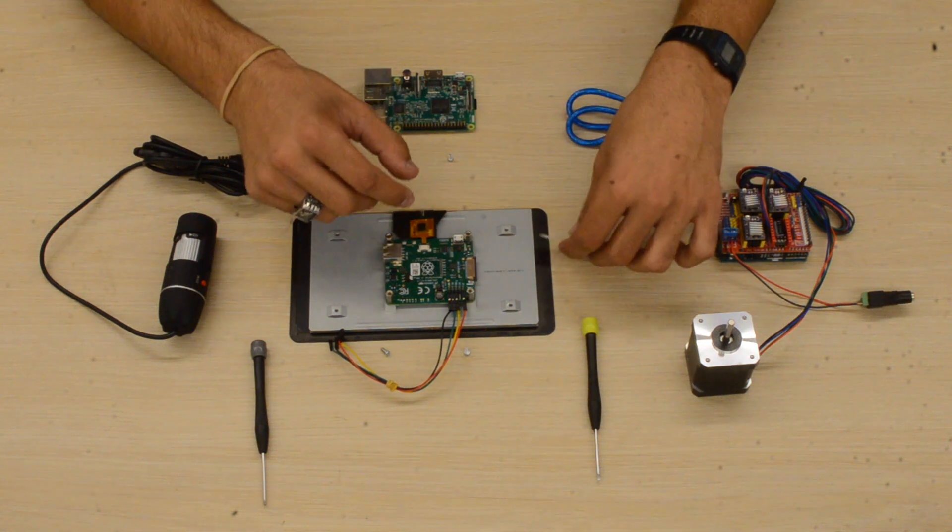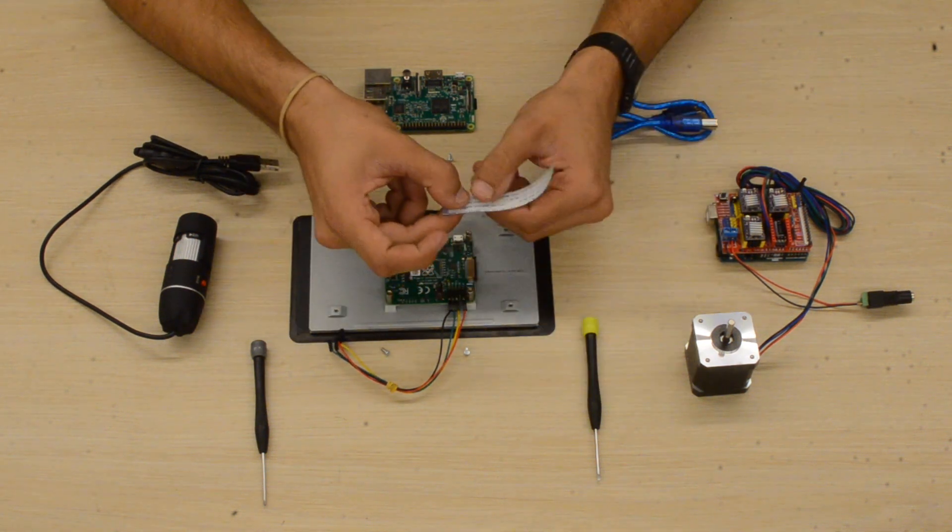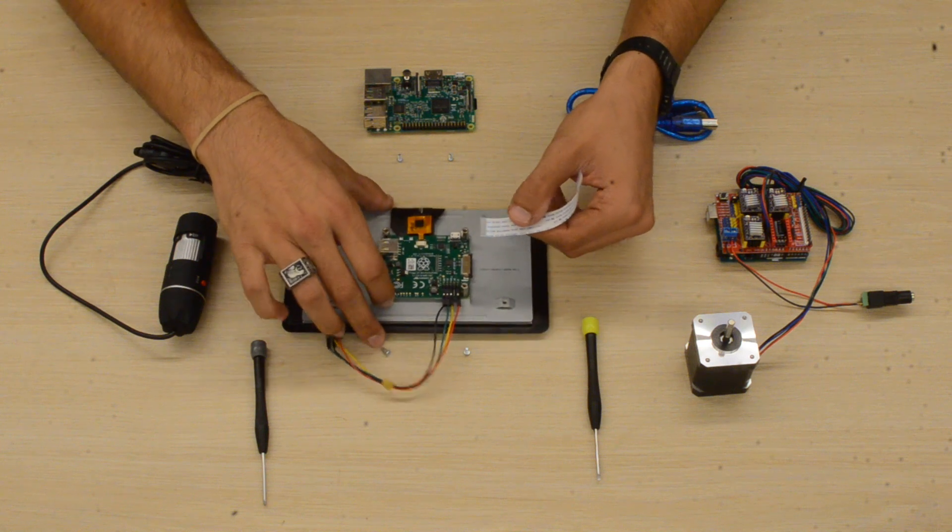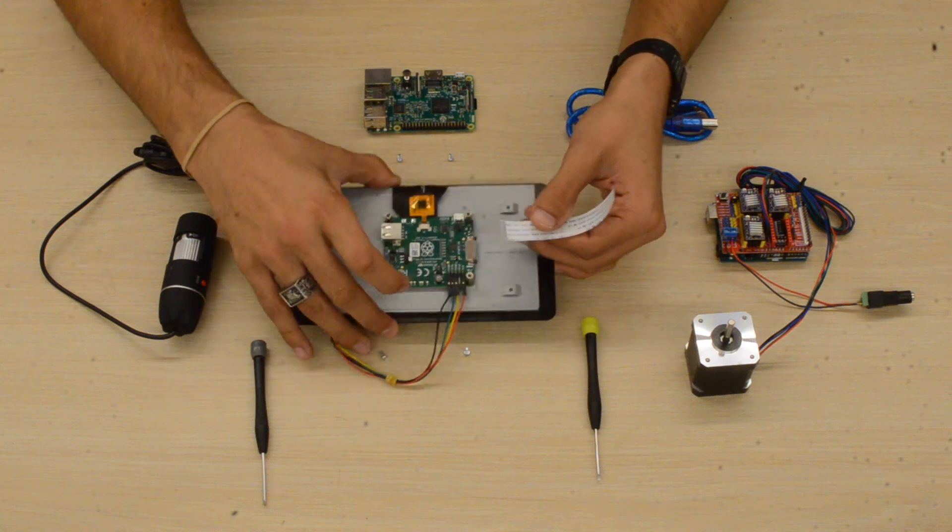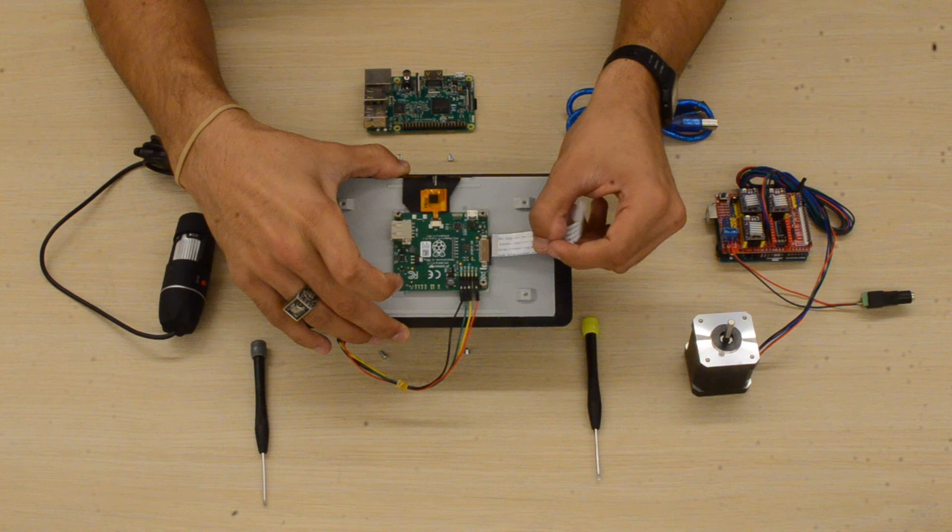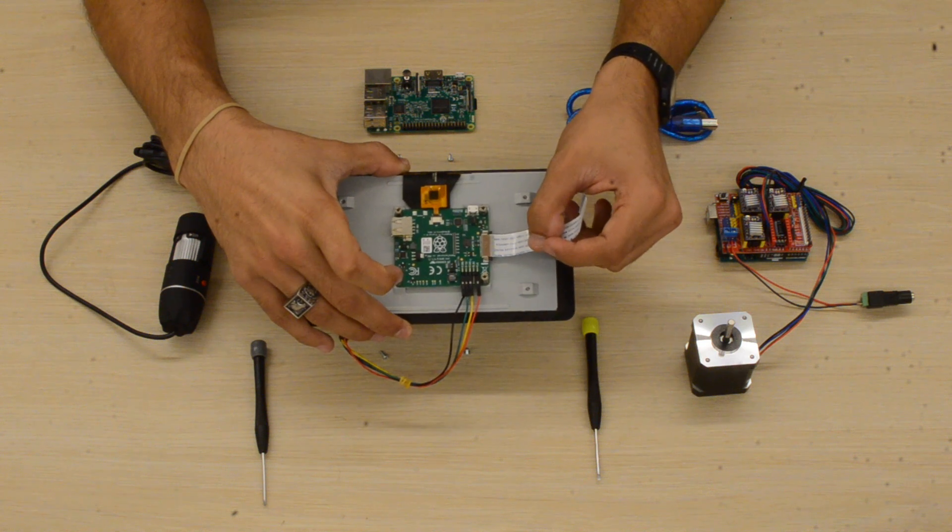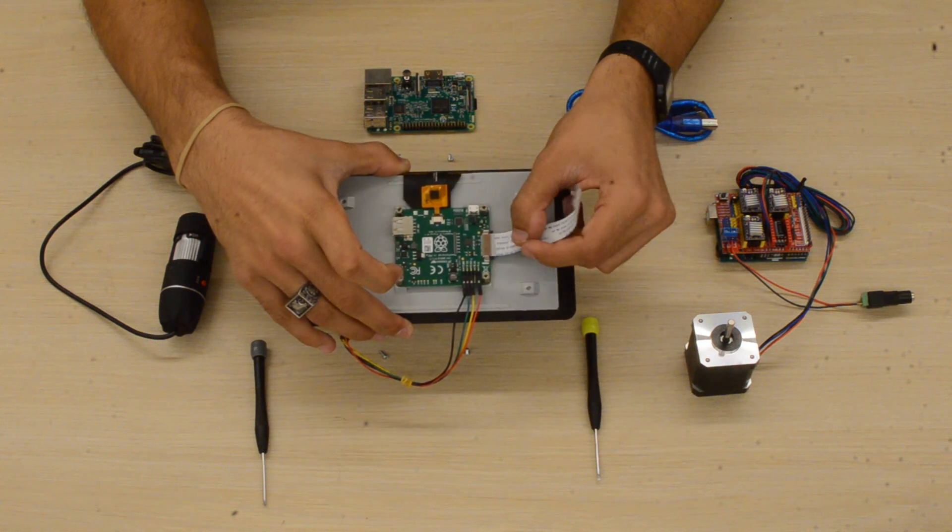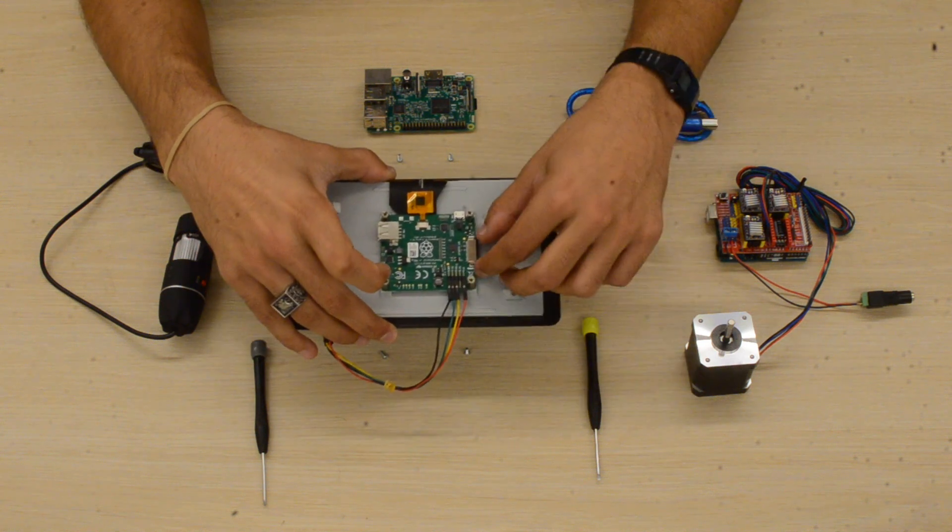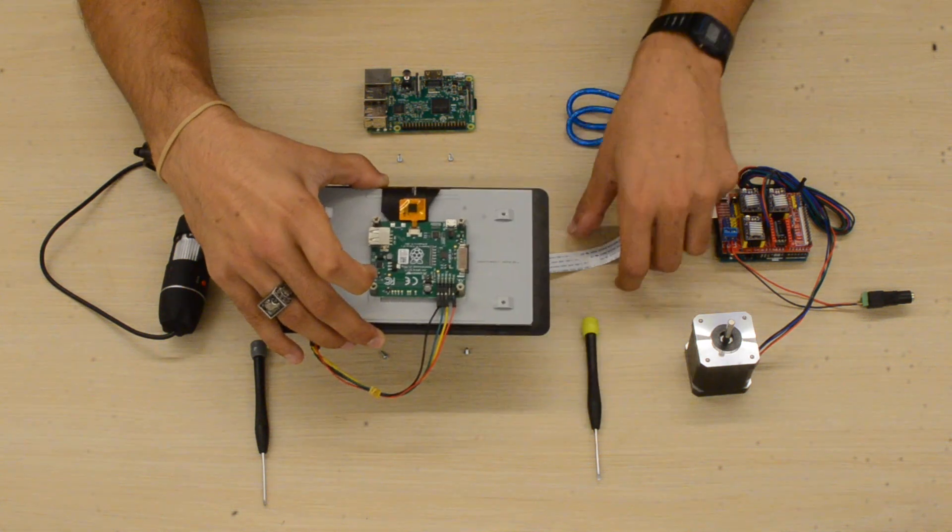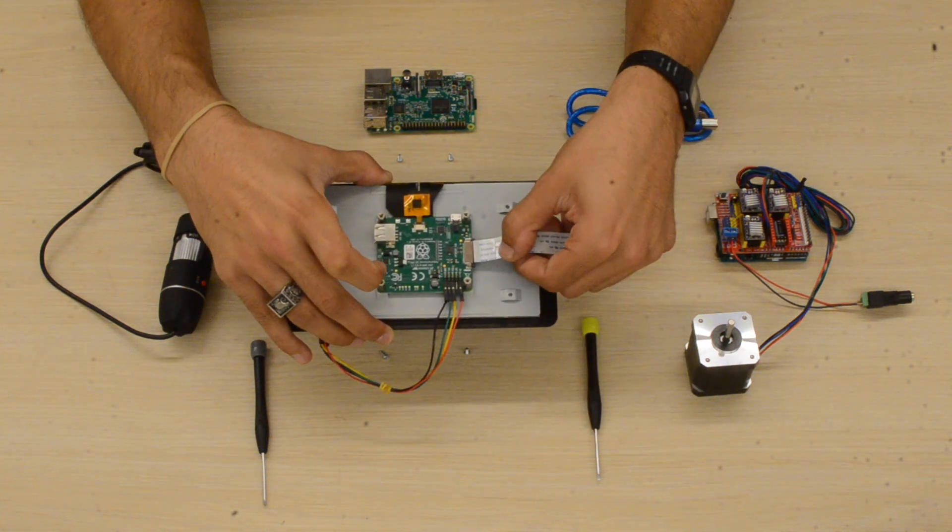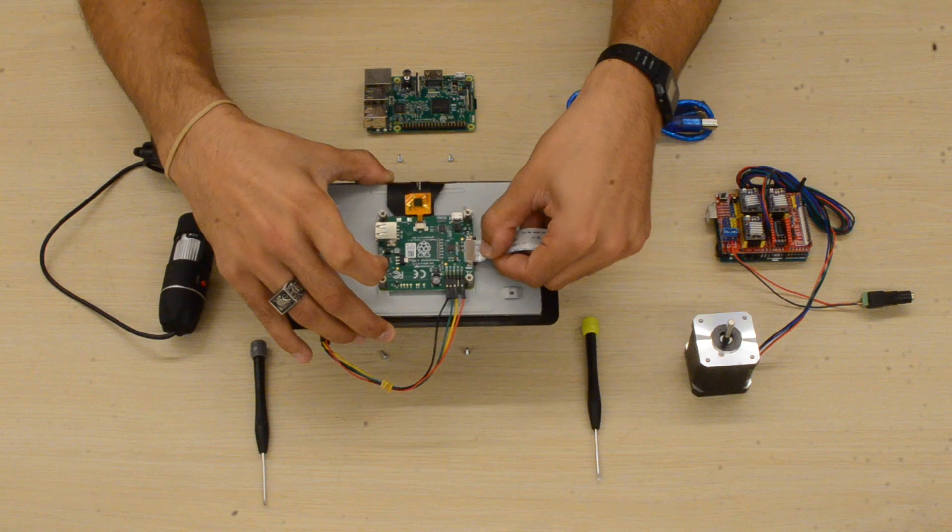Next, we'll take the ribbon cable and face it shiny side up into the ribbon cable connector. But first, we have to make sure that the connector tabs are pulled out. So as you see here, I pull them out and then the ribbon cable should just slide right in.